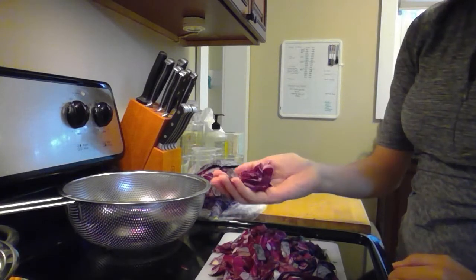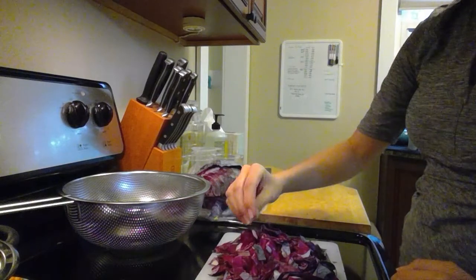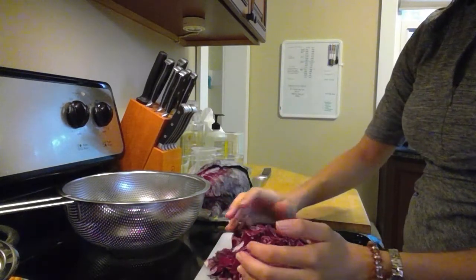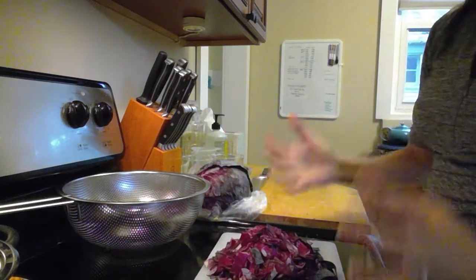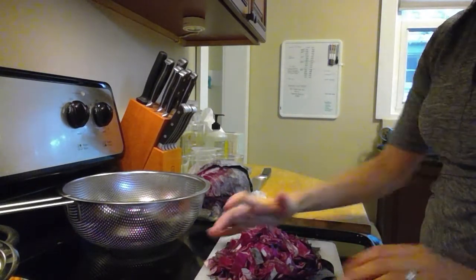You want to cut up about a half of your head of cabbage. So you should have a nice pile after you're done. Again, make sure to cut carefully, wash your knives afterwards, just like if you were cooking in the kitchen. And again, you want some thin strips of cabbage. If you dice them up smaller, that's perfectly fine, but make sure they're at least a 1 centimeter strip.